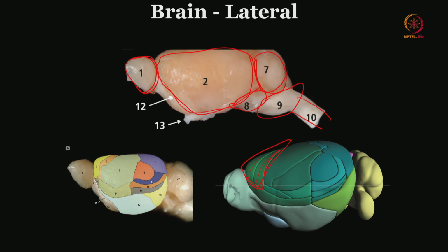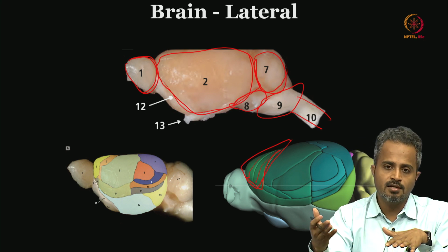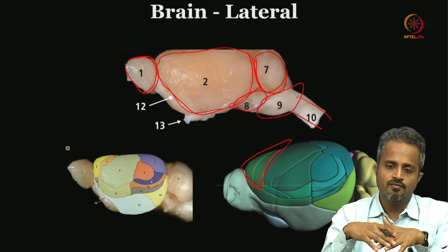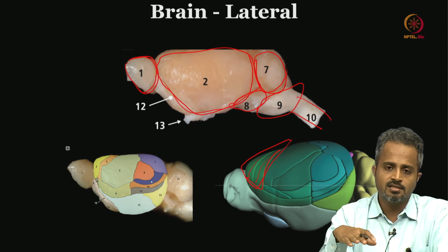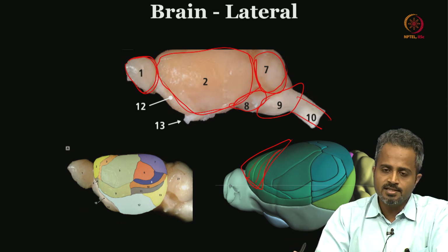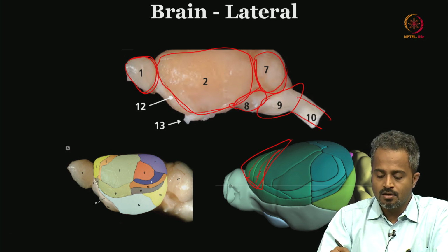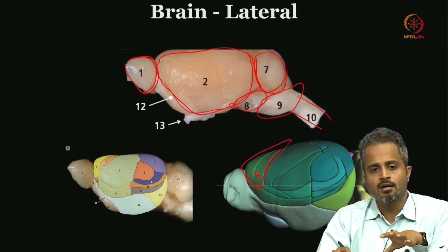It is very vital that you stick to your coordinates, and you need to make sure that the model you are using, the rodent species you are using, and the coordinates taken from the literature are the same. That is very important, and of course, the age and weight of the rat should also match, for a simple reason that you are depending entirely on coordinates, and coordinates are generated by taking serial sections and then putting a reference atlas, as I showed, that reference grid is your coordinates. So, when you are taking coordinates from the literature and using them for your experiment, it is very vital that you stick to them, so that you identify the motor area which is very specific for the action of the forelimb or the forepaw of the rodent.